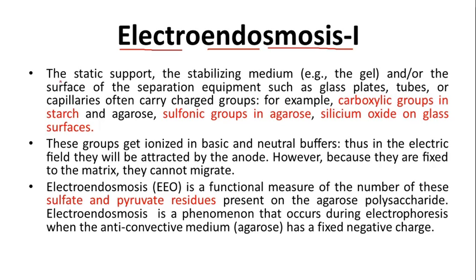You know very well, agarose electrophoresis or SDS-PAGE is a very versatile technique for the separation of molecules. For that we use some stabilizing medium. This medium is very important because it is the only part of the electrophoresis we can identify and manipulate. We place the sample on the stabilizing medium, and the migration takes place in the medium.